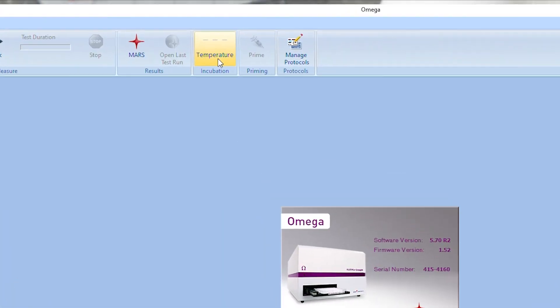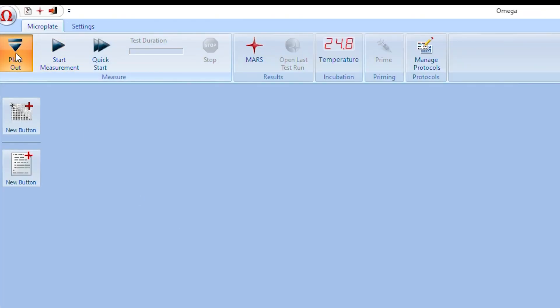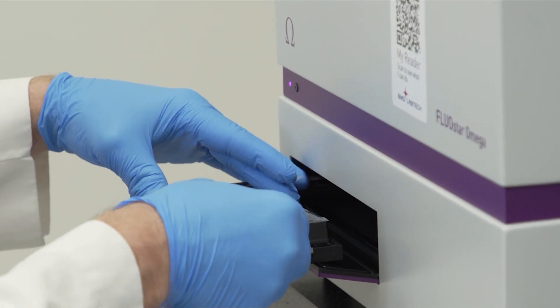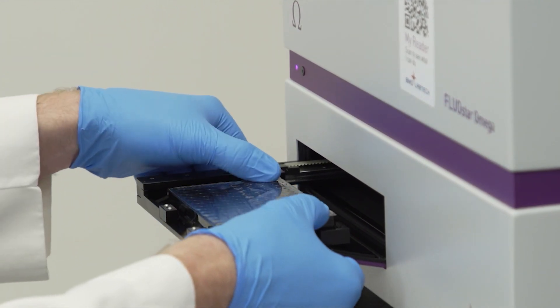Set the temperature on the reader prior to starting plate setup on the computer so that the incubator can reach the proper temperature. Insert plate firmly into the reader by pressing on the top of the plate and under the plate carrier simultaneously. It is important that the plate be properly seated so that the clips can hold it tightly in the reader.